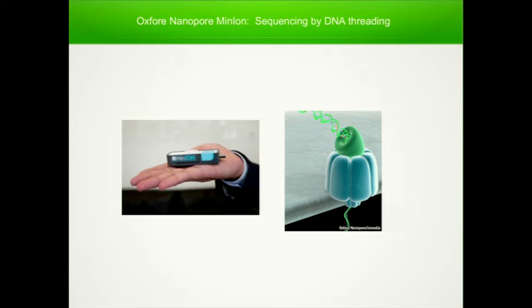You have an enzyme here, a helicase, or it could be an exonuclease. This is the membrane here, and this is the pore. And then you can pass this through this pore, right? So that is where we are moving to in sequencing technologies. As we make these changes, similarly, all the computation will also change. Analysis will also change. Basic concepts remain the same, but the other things will change. The entire field will change. Right? Fascinating?